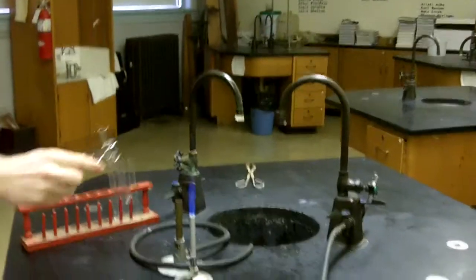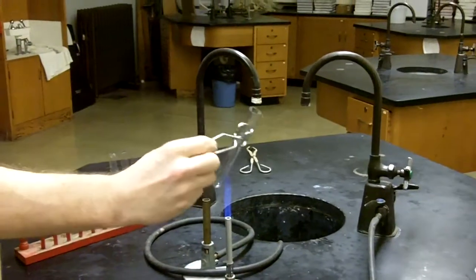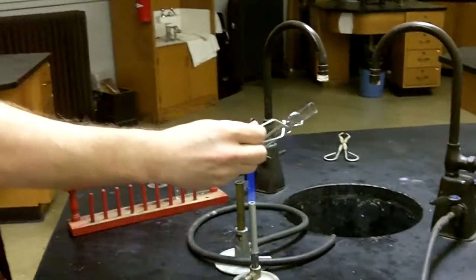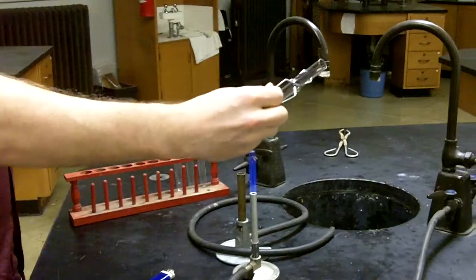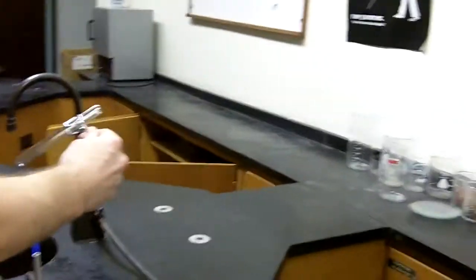So for example, if we were going to heat this up, which is not a good idea in an empty test tube - it will just get really hot. But if you were going to do that, you would angle it away from yourself, away from the other group, just towards an empty wall over there. It's always towards the wall.